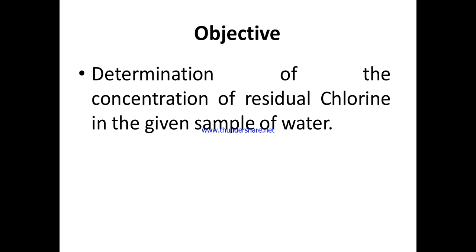Please don't get confused between chloride and residual chlorine. The chloride experiment we have done in the previous lab class. Okay, so that is the permissible limit of chloride, but as far as residual chlorine is concerned, the Indian standard code does not specifically prescribe any limit for that, but environmentalists and all the knowledgeable persons who are concerned about drinking water have concluded that beyond suppose 0.5 mg per liter, okay, or 1 mg per liter of residual chlorine is not good for drinking purpose, or domestic purpose to say.